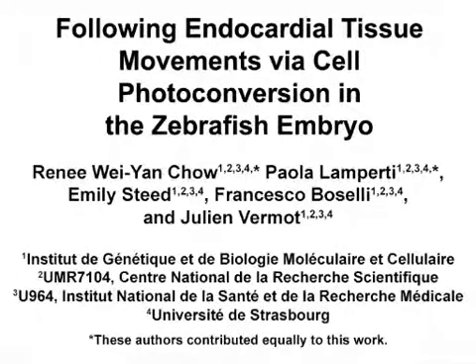The overall goal of this procedure is to follow endocardial cells during atrioventricular canal and heart valve formation. This method can help to address key questions in the field of cardiac development, such as to understand how endocardial cells behave in different types of mutants.